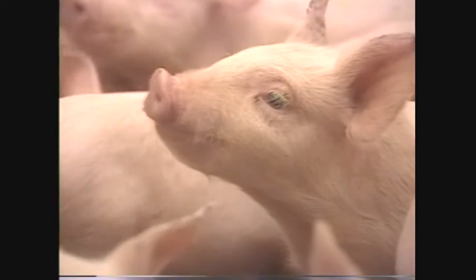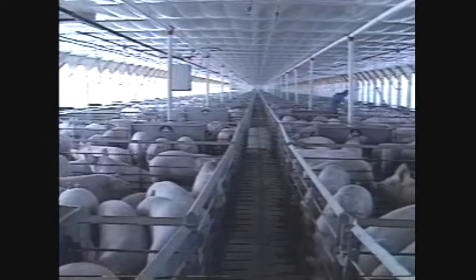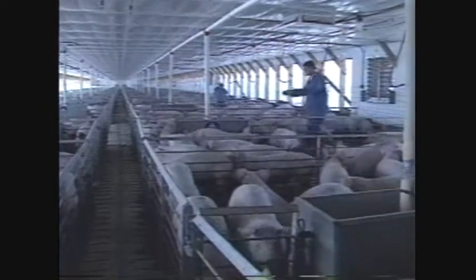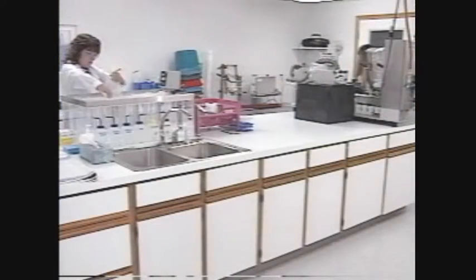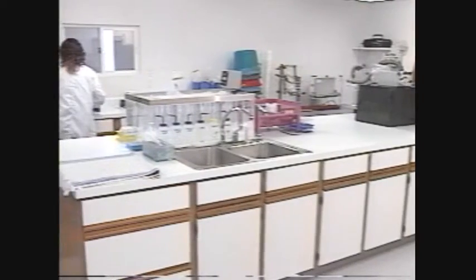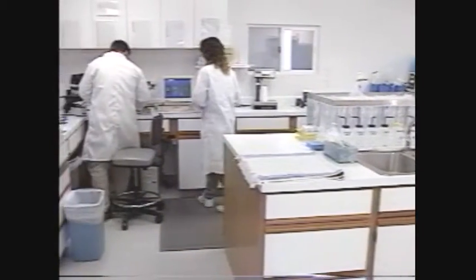There are a number of requirements that are essential for any AI program to succeed, regardless of the size of the facility. To be successful, AI requires attention to every detail involved. In this video, we will focus on the components and procedures of semen processing, and will emphasize the available methods and equipment to perform each step.